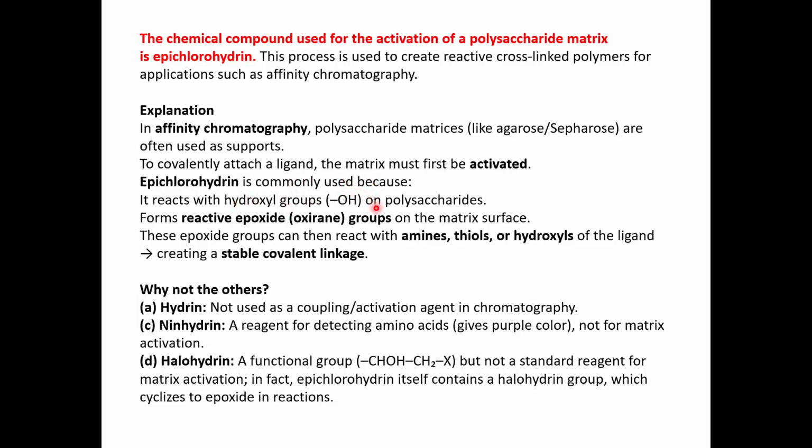It reacts with the hydroxyl groups of polysaccharides and forms reactive epoxide on the matrix surface. These epoxide groups can then react with the amines, thiols, and hydroxyls of the ligand, which will help the ligand bind on the matrix. So this creates a stable covalent linkage.